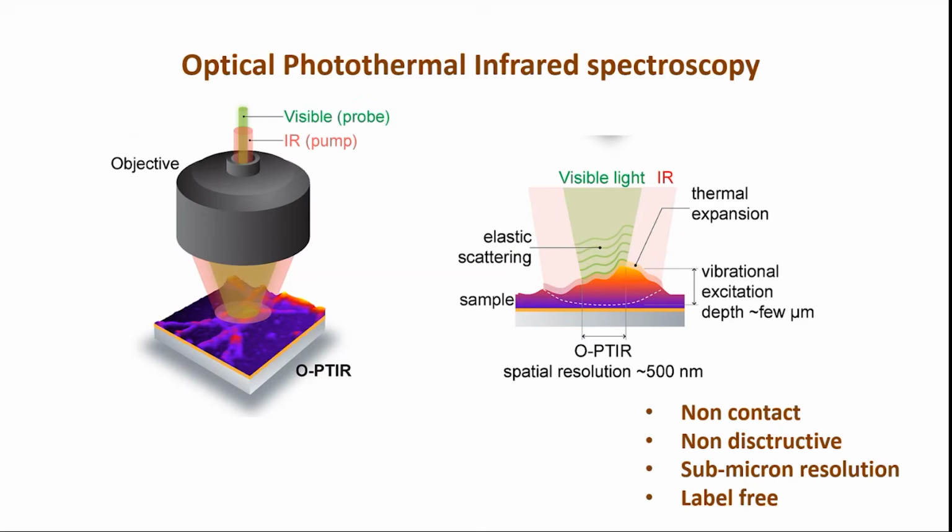After that, I was super lucky to learn the OPTIR technique and to be at synchrotron Soleil in 2018, to use it for the first time simultaneously with synchrotron-based FTIR on brain tissue slices. I really value this technique because it is non-contact and non-destructive, and it gives submicron resolution, which is extremely important when we are talking about multimodal sample characterization.